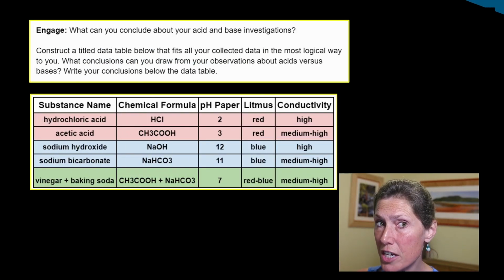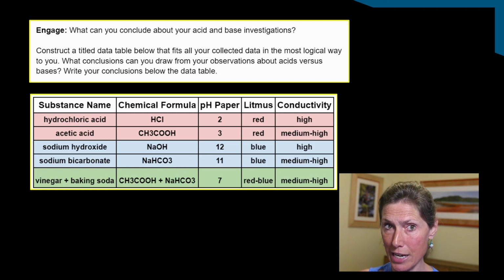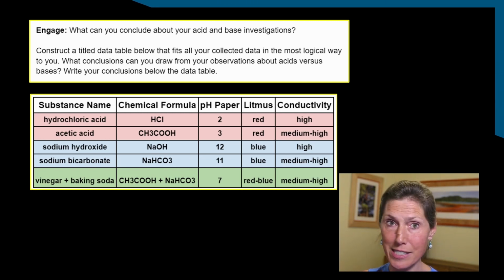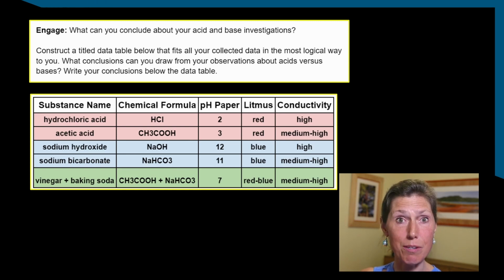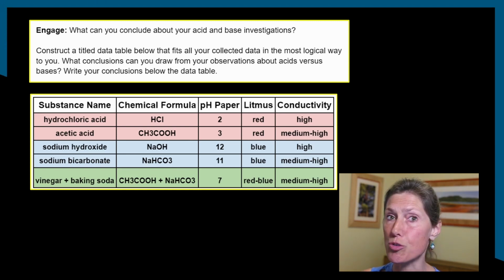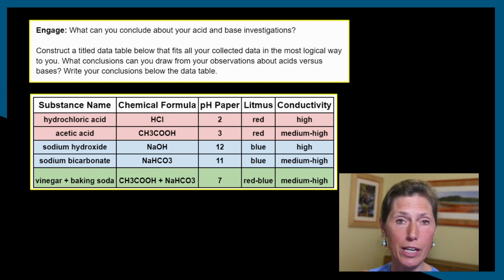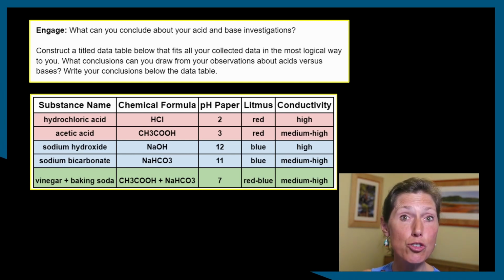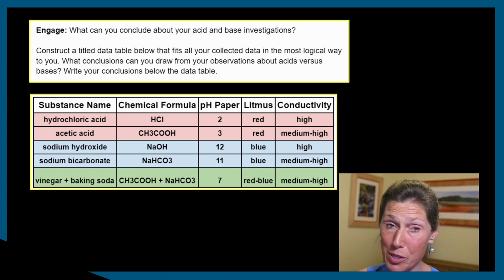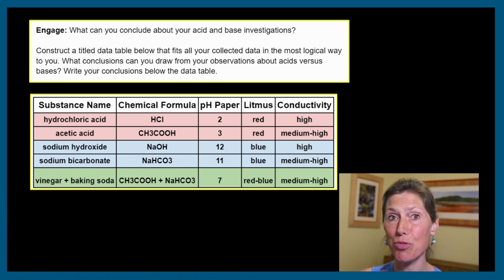Okay, they've done the Explore. Let's now engage them by analyzing their own data. I don't give them a data table. Let them construct it themselves. This is my sample key data table constructed in Google Sheets, which they can incorporate right into a Google Doc with a hyperlink, or do it using pen and paper, whatever you prefer.